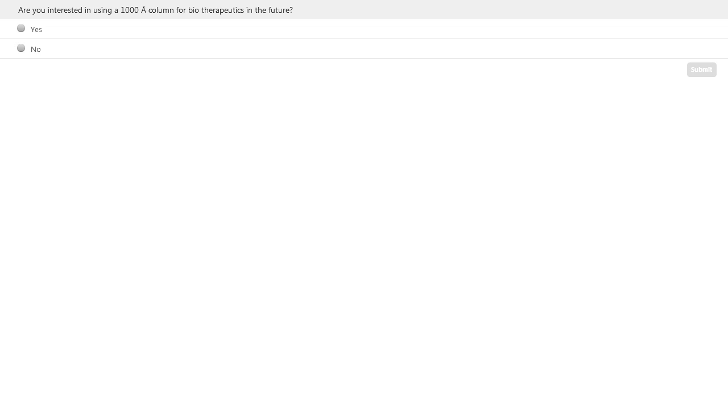I think we'll do one more question, and that is, if pore size is important, why is the separation I see in my 1,500 angstrom product not adequate? 1,500 angstrom is a fairly large pore size. It's possible that it's too large. I couldn't say exactly why you might require that large of a pore size to do your separation, but that's something that we're willing to engage with you about if you are curious about what type of pore size is actually desirable for your separation.